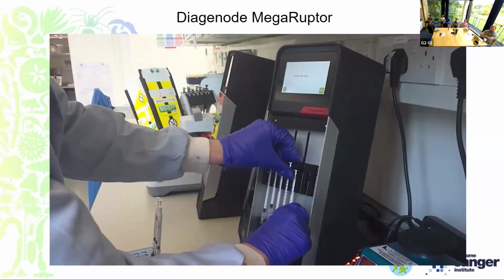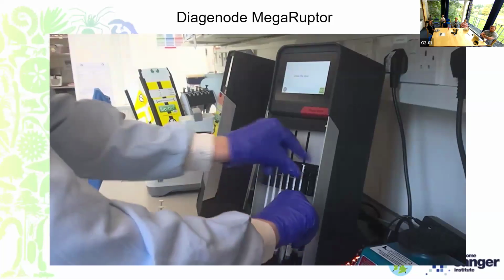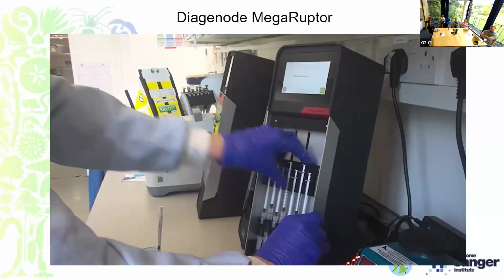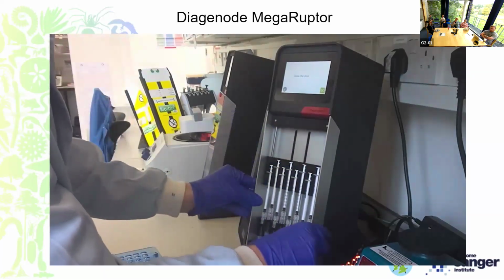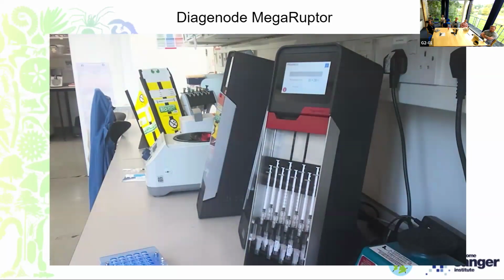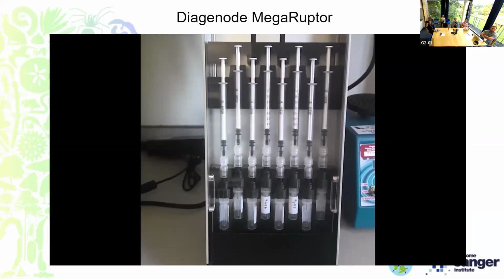If you have fewer than 8 samples, you should use a balance on the instrument. That's just an empty tube and an old syringe. Once the instrument starts, the plungers of the syringe are pulled up and down and pushed down, and that draws the DNA through a hydropore at the bottom of the syringe, shearing the DNA into shorter fragments.